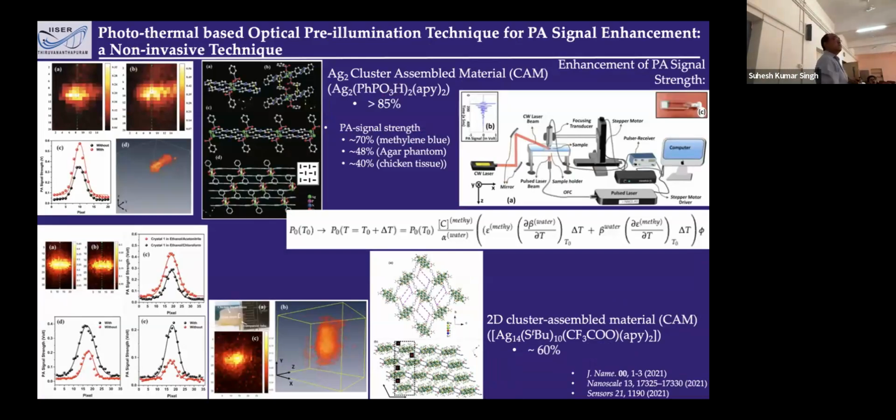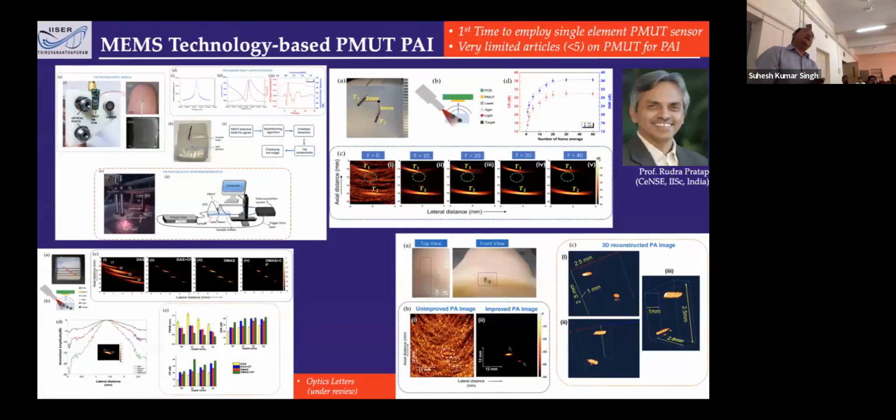Some fabrications of the nanoparticles, whether they have the photoacoustic effect, that is aimed for clinical applications. So this is our work. And at the same time, we also tried adaptations of this micro machines technology of the PMUT ultrasound sensing systems, and then look at potential applications.